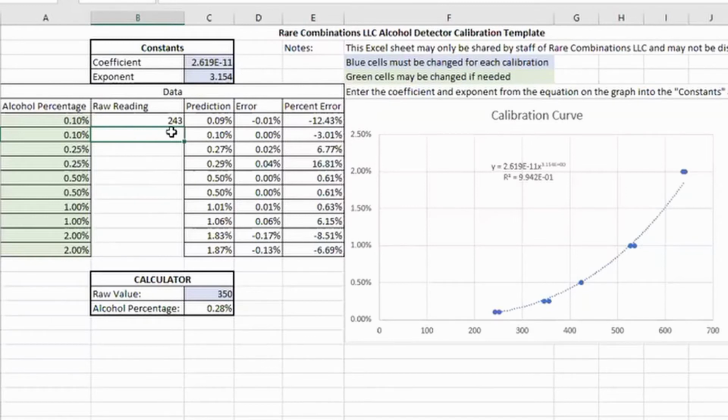And then you pour out your old 0.1% sample that you read already, and then you pour in some new 0.1% standard from your liter stock of calibration standard. You screw this back into the detector, and you wait again until the reading stabilizes.